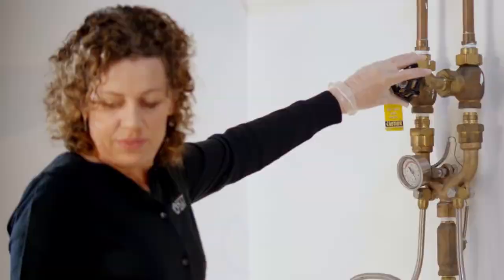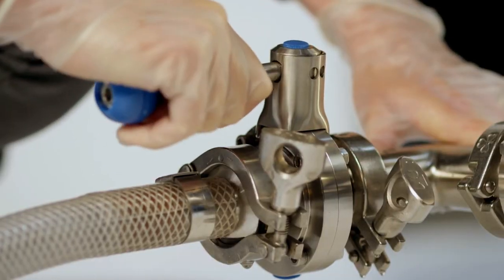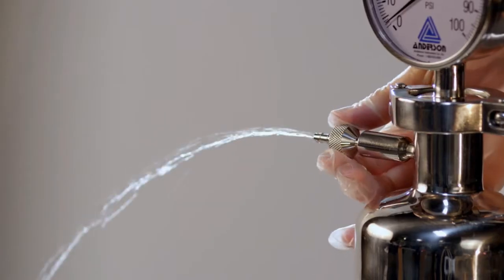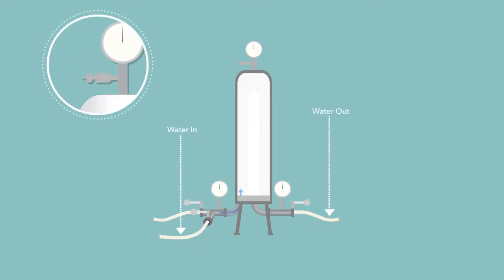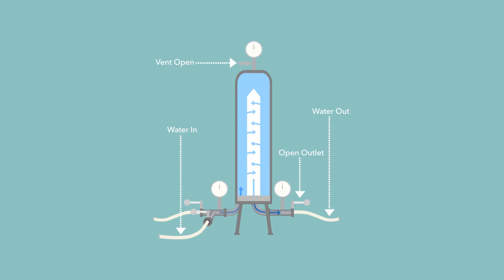Open the water line, being sure that inlet and outlet product lines are closed while vents and drains are open. Make sure that while rinsing with water, the vent is releasing water to ensure full wetting of the cartridge. Once the housing is full, open the water discharge outlet to begin rinsing.